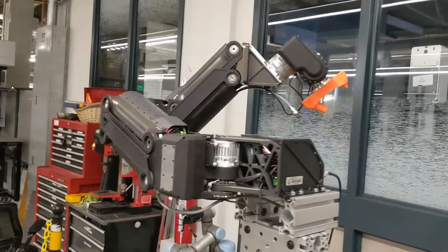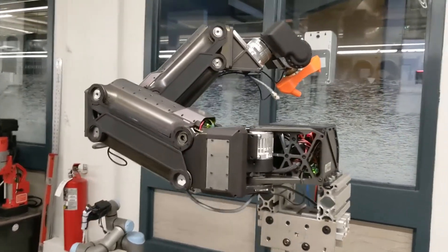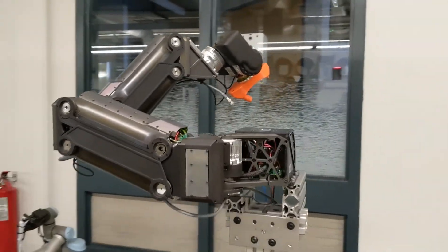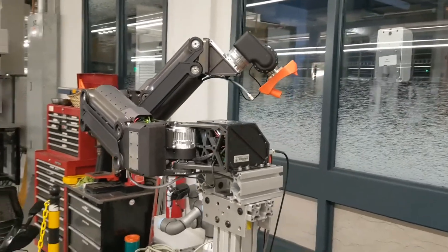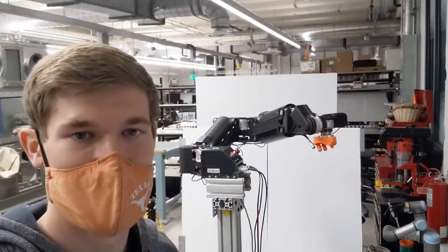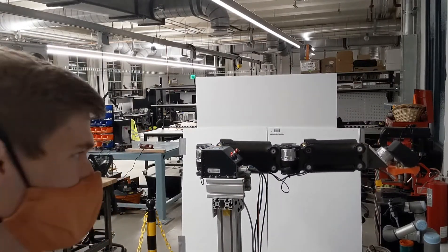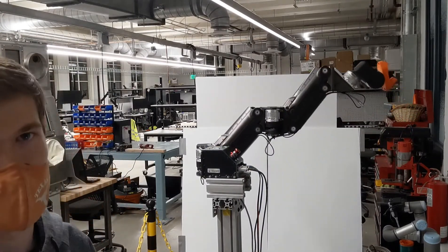So while I would get tired holding 10 pounds in front of me for just a few minutes, Scorpio is passively balanced and doesn't need to exert any energy to hold a given position. I'm going to run Scorpio through its workspace demo, just to show you the range of motion of a system like this.